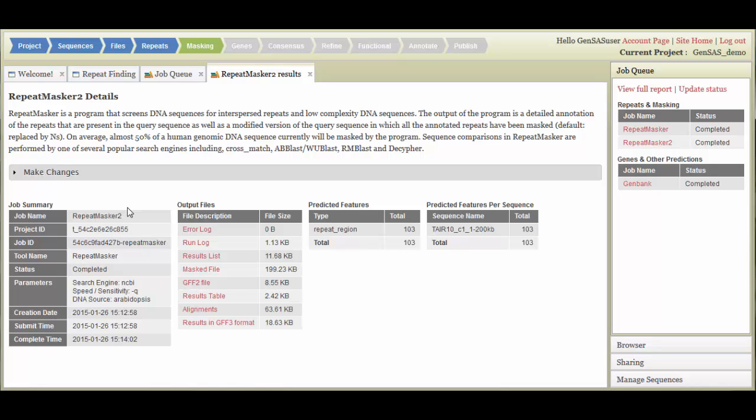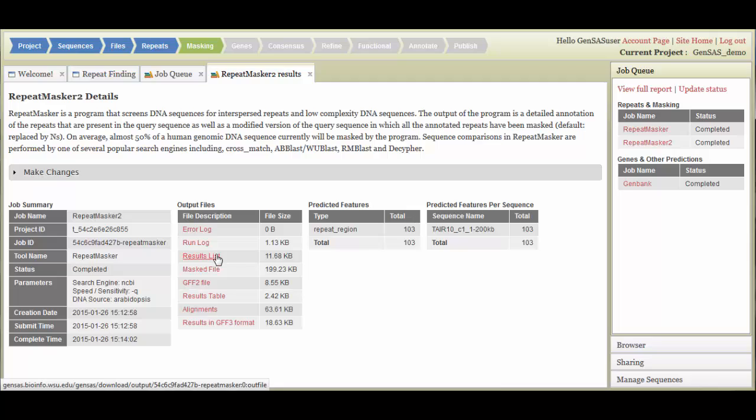On the Job tab, you will find the summary of the parameters that were used, as well as the raw output and log files, and a table that summarizes the number of features that were annotated. You can download the output files by clicking on the file names.